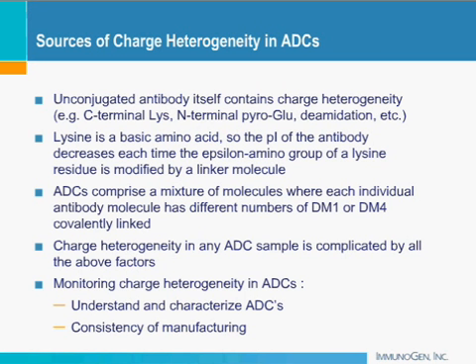Here we compare the ICIEF profile generated for an antibody-drug conjugate to a mass spec profile. And we see very well that the charge distribution profiles that both these methods give out are very comparable. It's just that because of the different mechanistic nature of these two methods, the profile distribution is in the opposite order. So for the ICIEF on the top, you have the unconjugated antibody peak on the rightmost side, which is the P1, and then the different conjugated species span left.